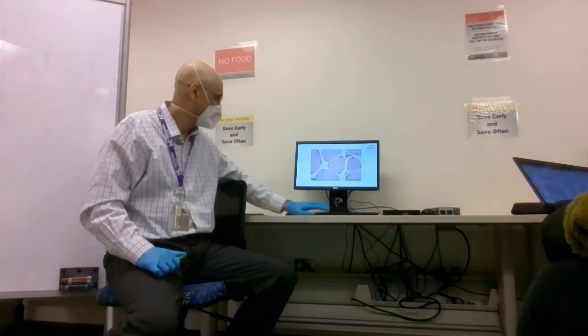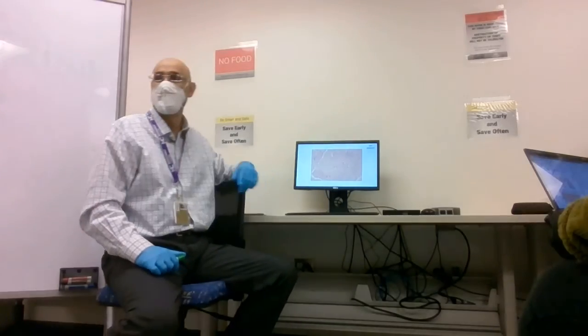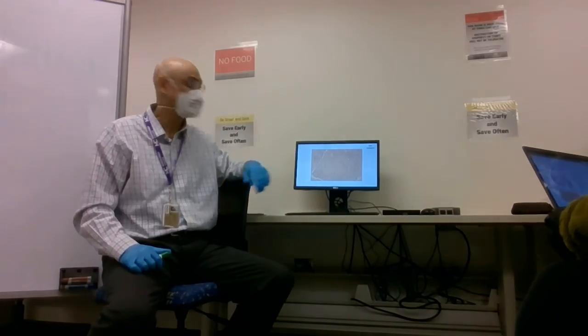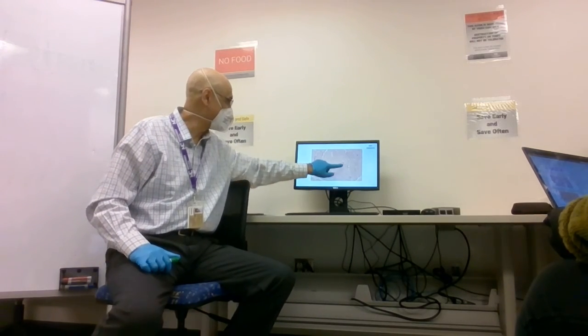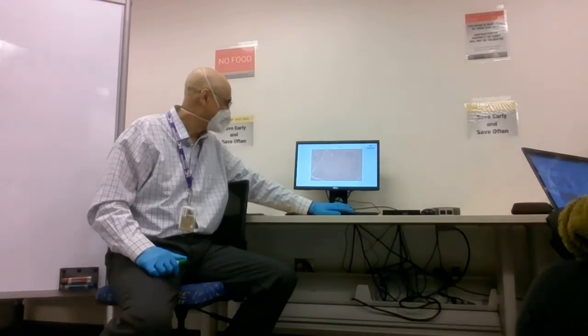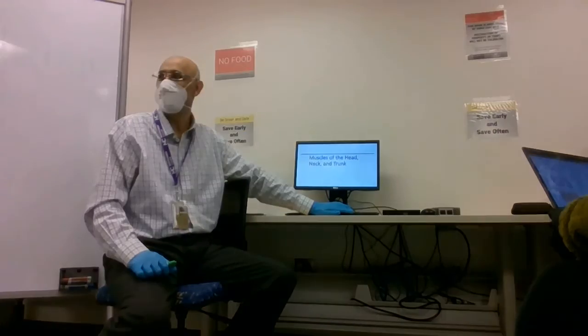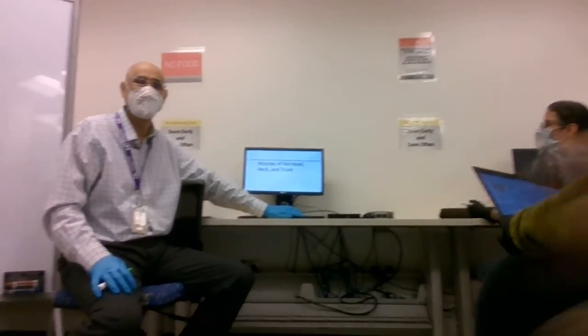Excellent job. Here, what is this whole thing, guys? It's a fascicle. Agree? If this whole thing is a fascicle, what's this yellowish part? And what is this individual cell around it? These empty spaces? Endomysium. So that's not so bad, right? You happy with the histology? Yes. You can get 100%, right? Yes, so happy. All right.